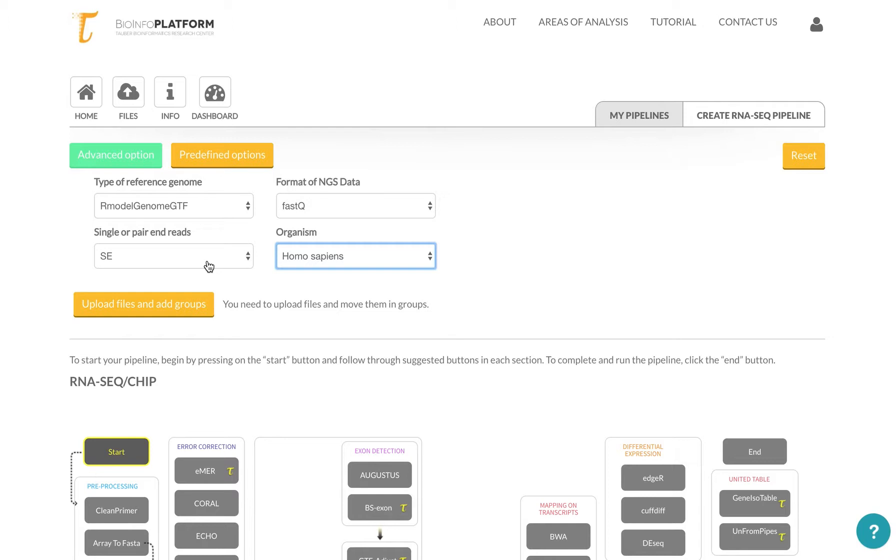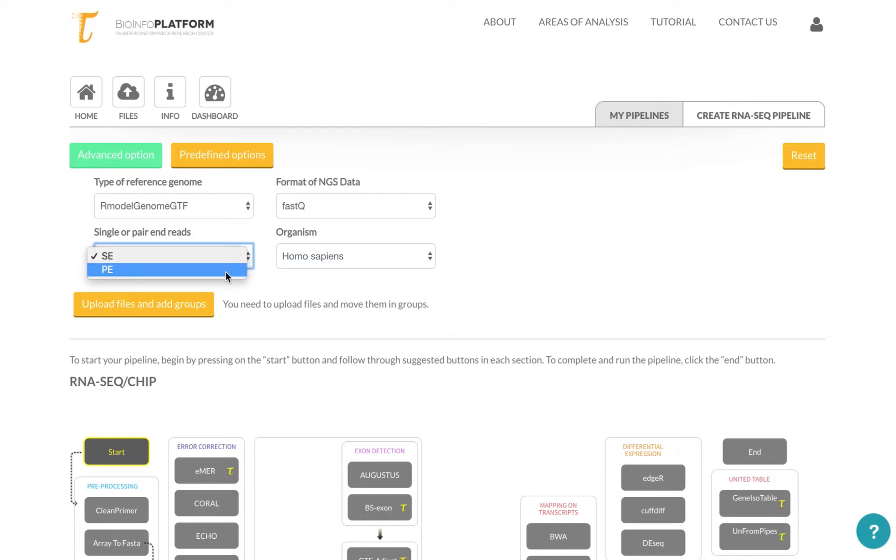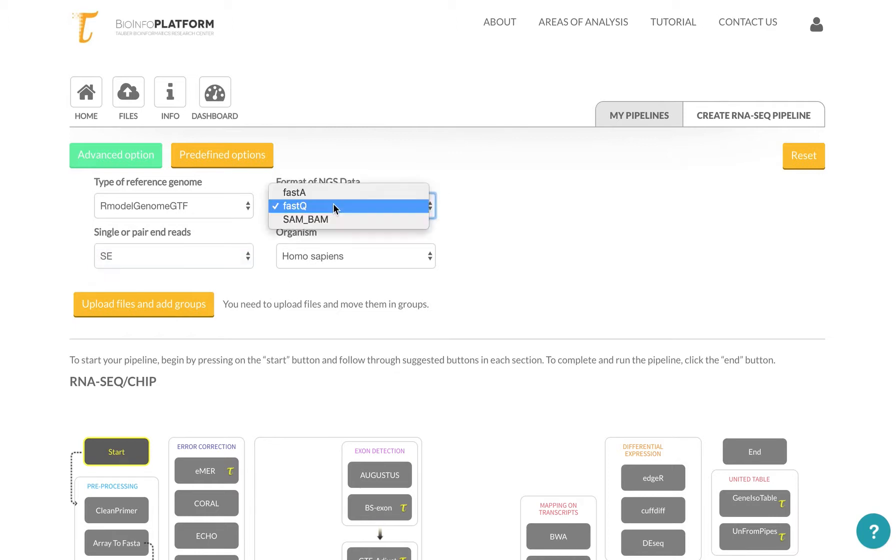And you can select a number of formats over here. Additional formats are available, but we have not put them as defaults under this dropdown.